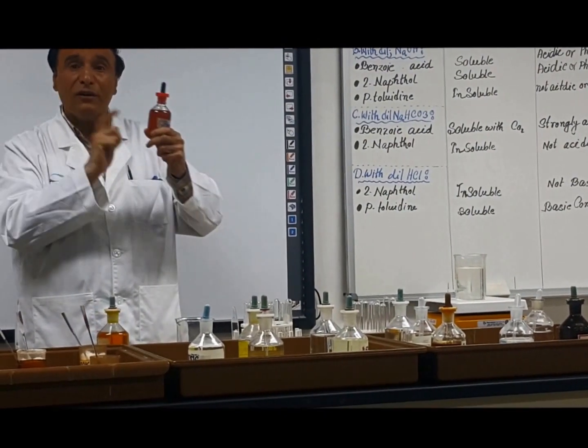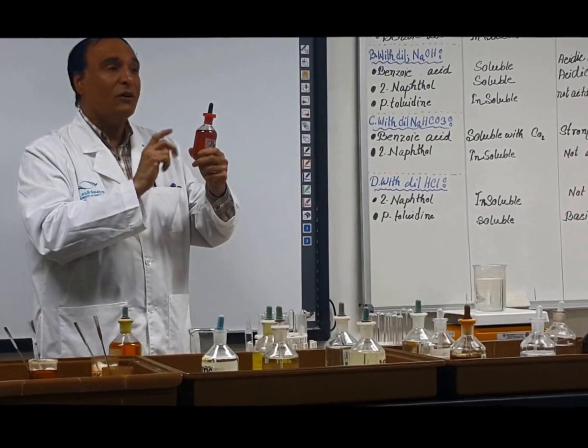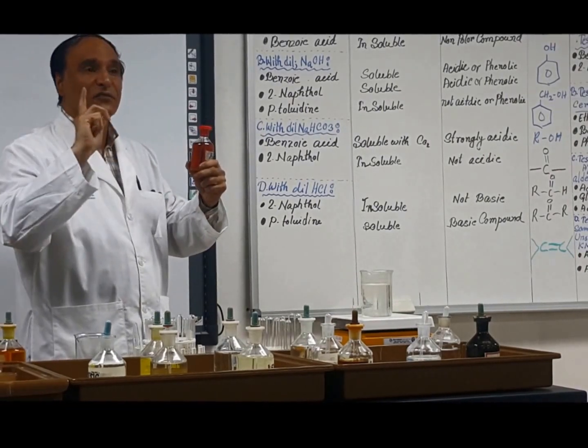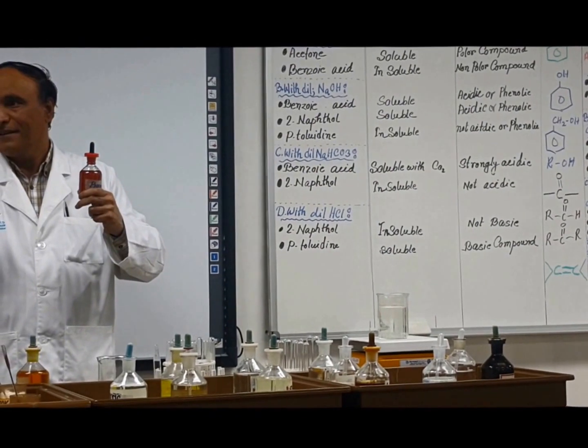Because you know that phenols are acidic. I told you in the beginning. So we will wash the hand with a base to neutralize it. You understand? So if you touch, take care of this one. If you touch, wash it immediately and inform.